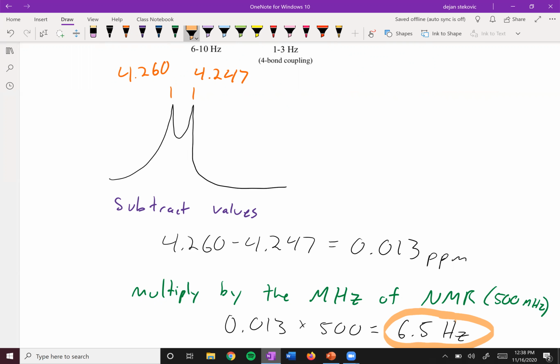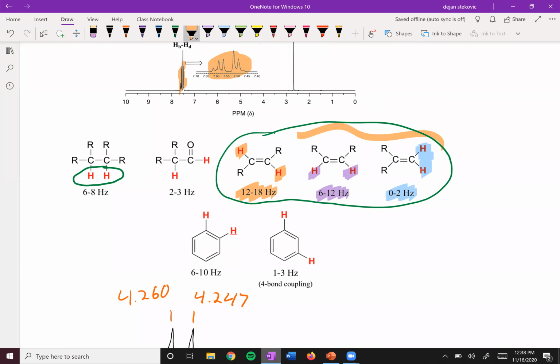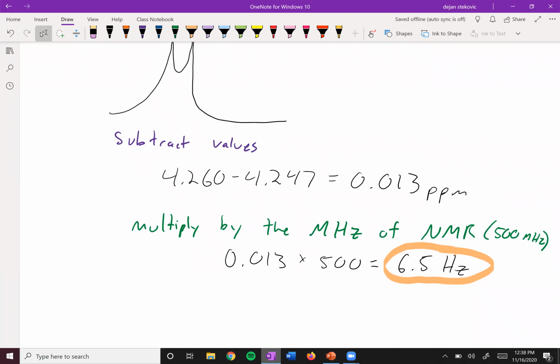And so, right, you could use this value, say you knew that this was an alkene. What kind of splitting would you have here? Oh, well, you'd say, because the coupling constant is 6.5, we probably have some kind of cis alkene. Again, take a look at the work alongs. We won't see too much of this complex coupling.